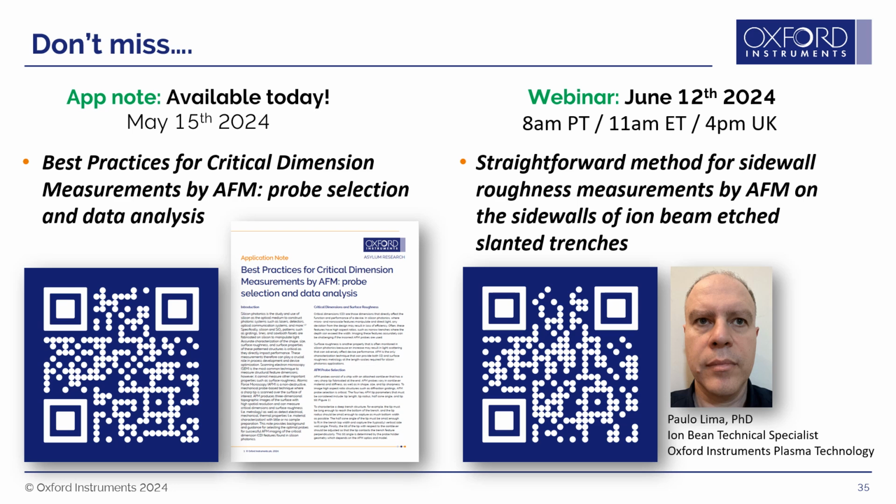So the amplitudes are actually high, just because you can think of it as you want your cantilever to oscillate as much as it can, so that it can go into the feature and then come out. Usually what we do is we set the amplitudes to be high, and the set points to be a percentage of that amplitude, so you can still achieve tapping, which is not too harsh on your sample, just by having an amplitude that is high and the set point that is decreased just by a fraction of what it was in free air.